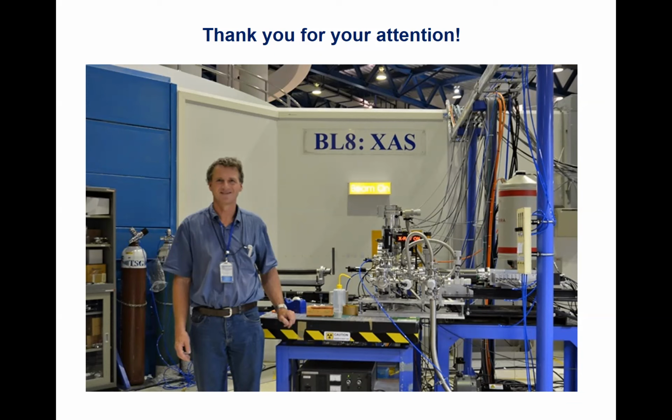But at least maybe we should look at how the system is really functioning. We could work with well-defined systems. For example, for the calcium divalent bonding issue, we could work with so-called artificial soils, which only contain carbonate, citrate, and calcium.